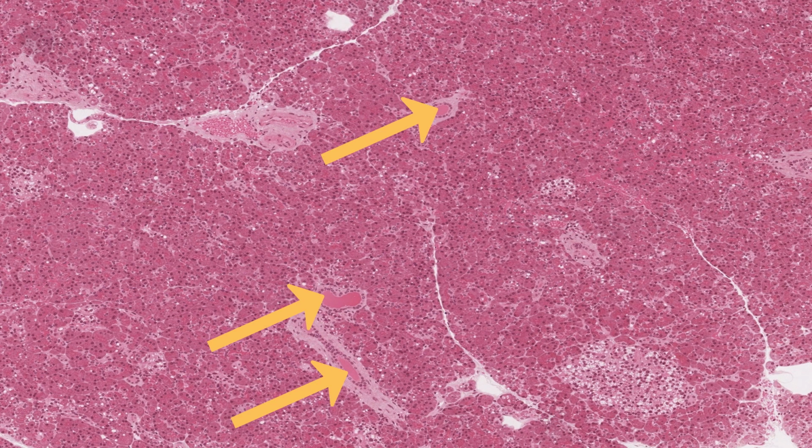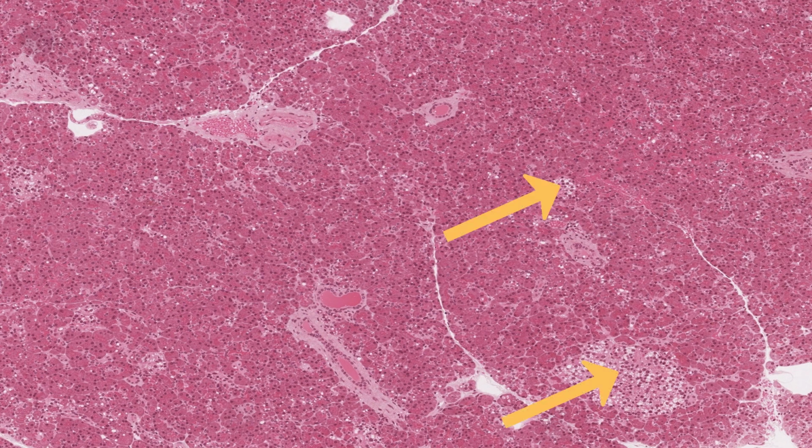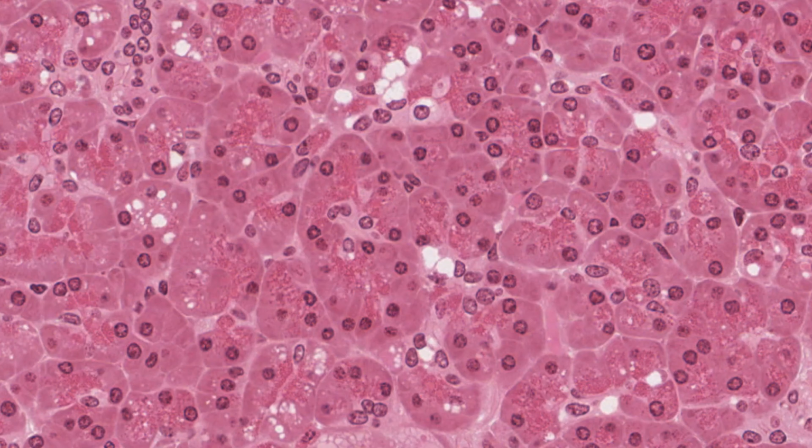And again, the endocrine portion is the series of pancreatic islets, or islets of Langerhans, that you can see as these rounded, paler areas embedded within the lobules. A lobule is filled with irregularly shaped acini showing 2 to 10 nuclei in each. The nuclei are located at the basal end of the cell, which is distinctly basophilic.